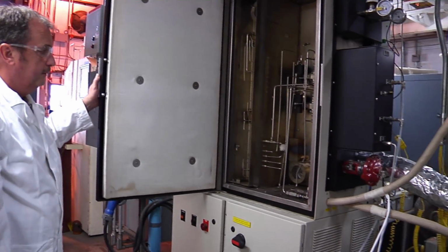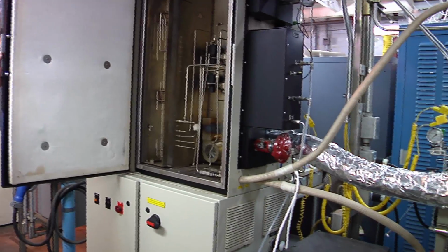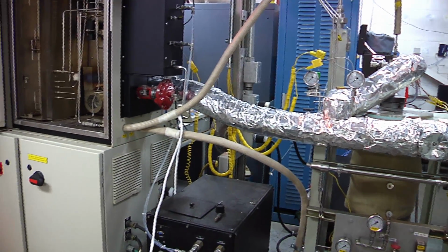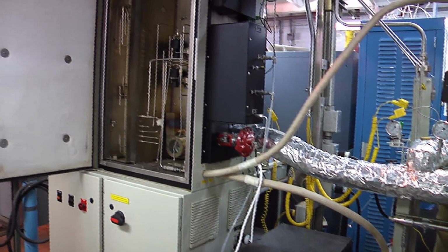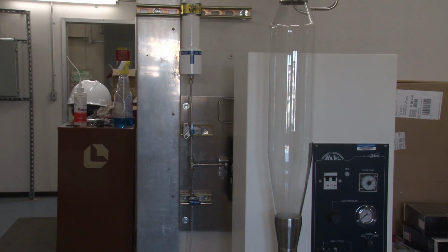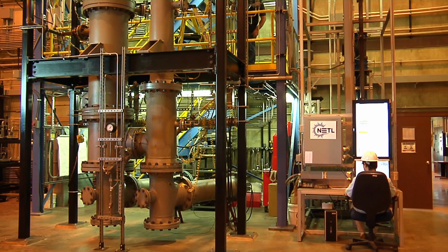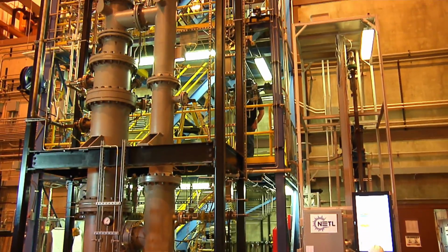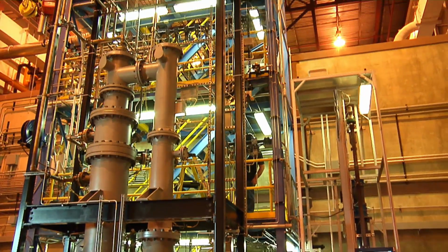In order to survive during long-term tests, the oxygen carriers must be durable with high physical stability or high attrition resistance. Researchers test samples with sufficient reactivity for attrition resistance under more rigorous conditions. If results are favorable, the sample is produced in large quantity for testing in NETL's pilot-scale chemical looping reactor.